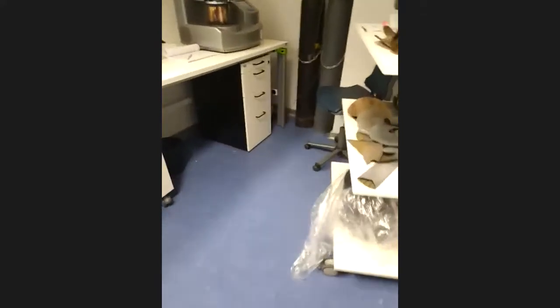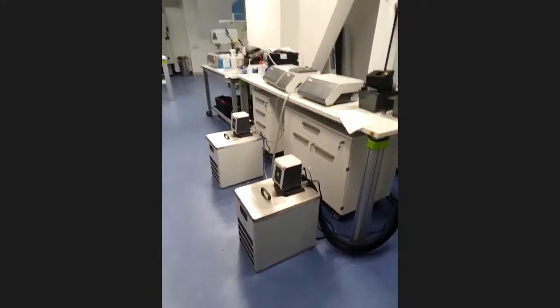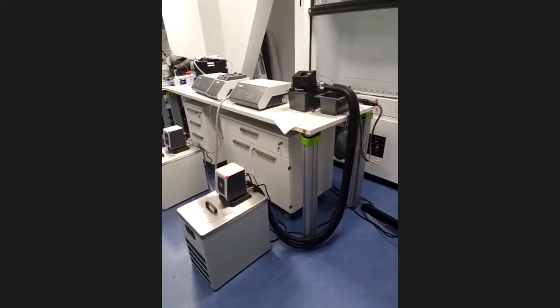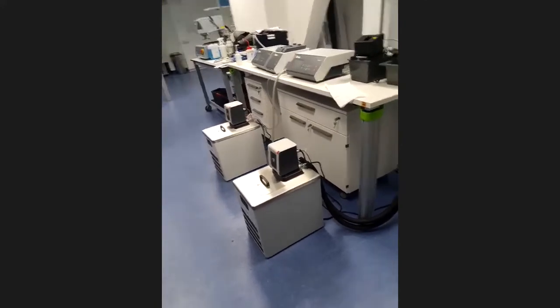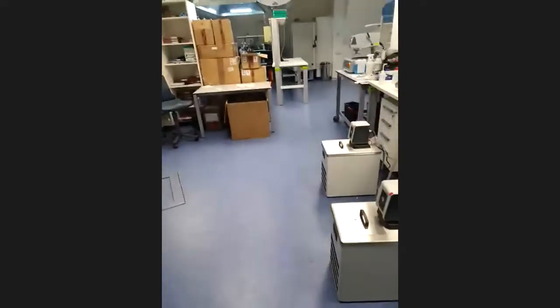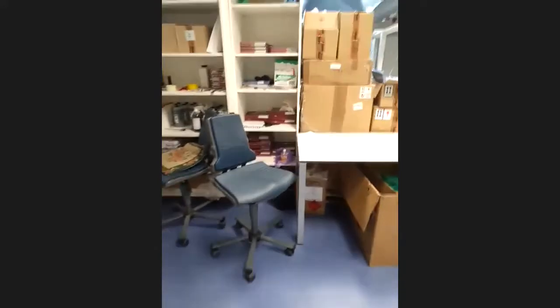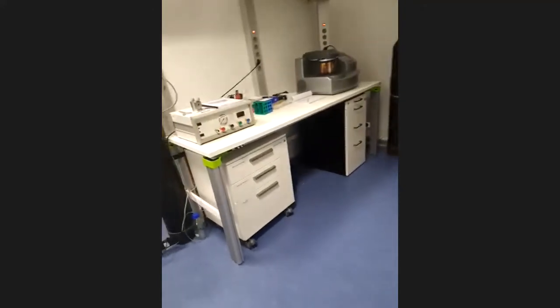Just because for transmission microscopy you should take a very thin area, something around 50 nanometers for good result. And we can take this area during 3 or 4 operations. And this is not so easy, and each sample has its own peculiarities, and each sample wants attention.